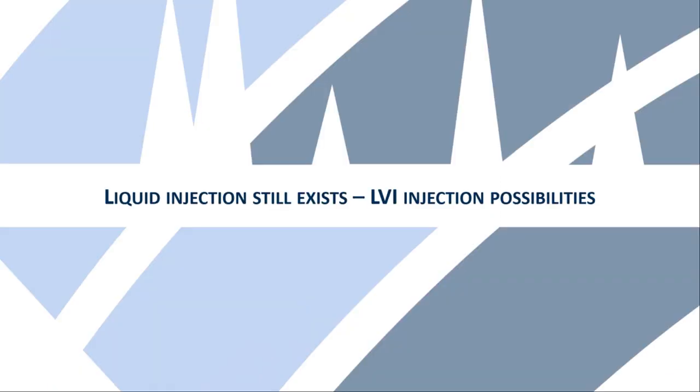We discussed some improvements done in headspace sample introduction. Let's move on to liquid injection, and more specifically large volume injection, LVI, which recently gained a lot in robustness and which is often still not correctly used and therefore easily ignored in routine analysis.